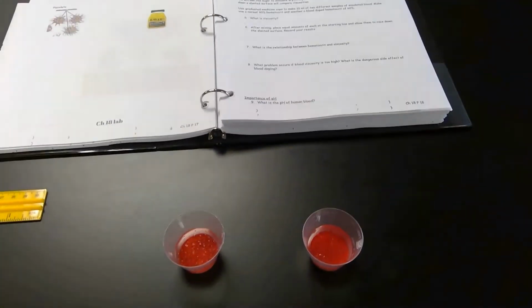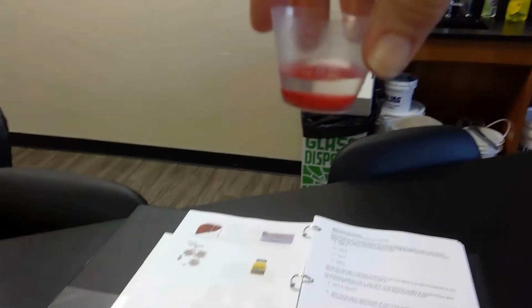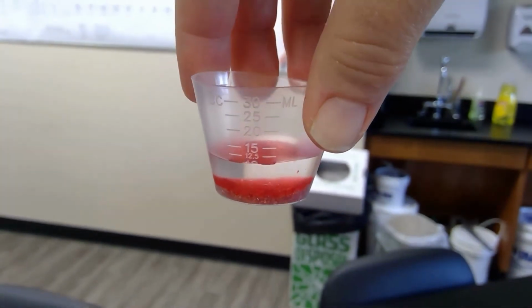Okay, the next part is viscosity. So there is a relationship between hematocrit and viscosity. So I used some red sugar, like from the baking section at the grocery store, and corn syrup. And I have these little cups that have marks on them with numbers.